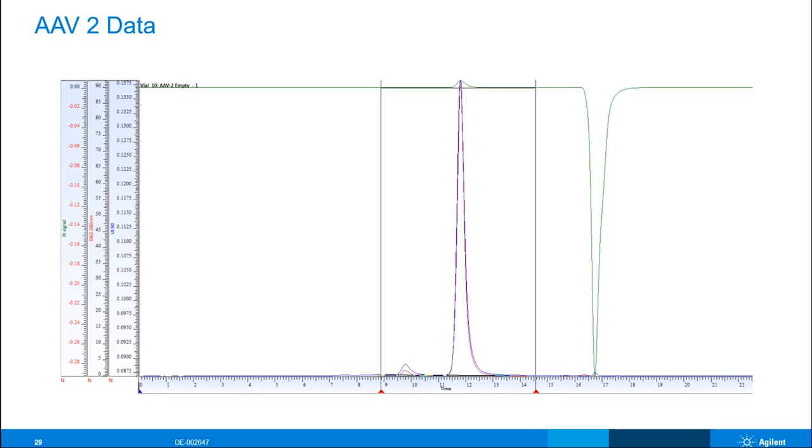So the second thing that light scattering is quite useful for is determining the size in solution of a molecule, and we'll dig into a few examples of this as well, like we did with molecular weight and aggregation.